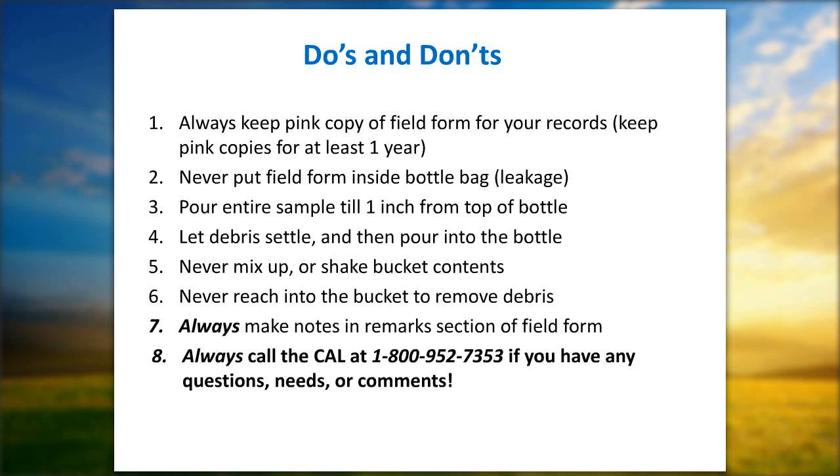Yep. Number 2, Jeffrey showed a picture early on. We have the bottle bag. That's to contain leakage from the bottle. Please don't put your field form in there. It won't keep your field form dry. In fact, it'll get wet from potential leakage from the bottle. So keep that separate there. Number 3 is also important in winter.